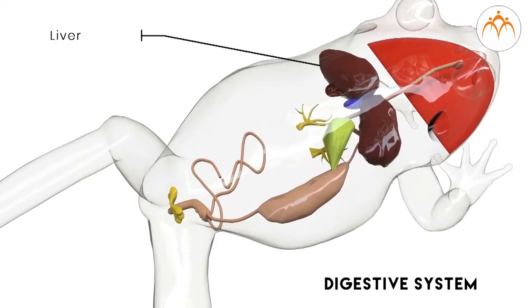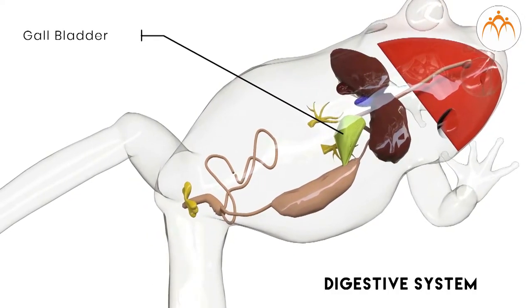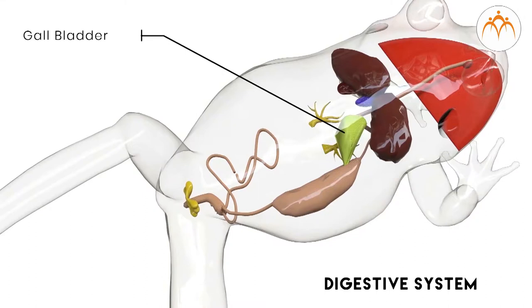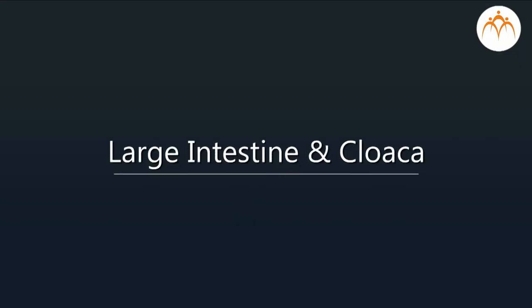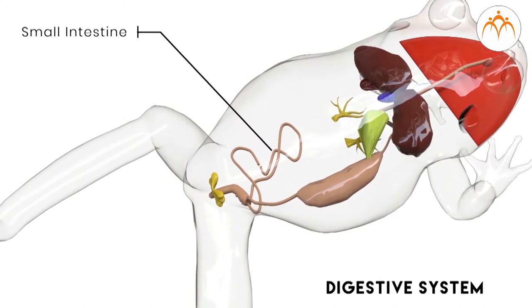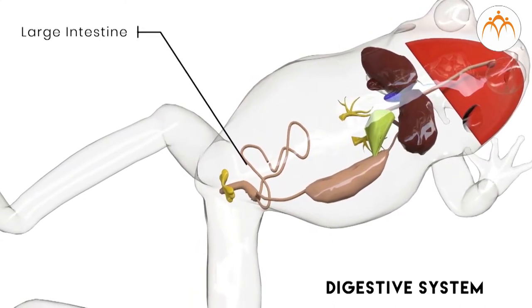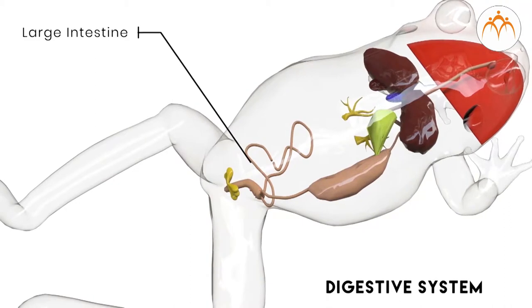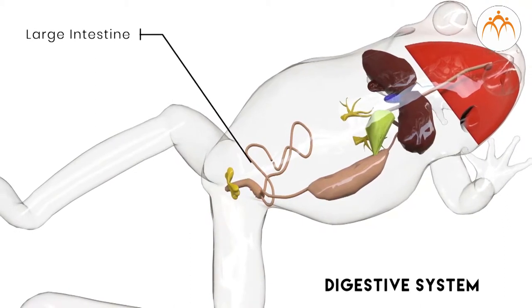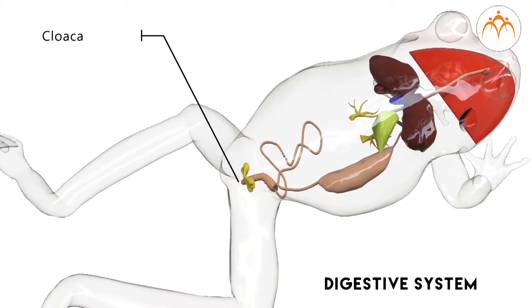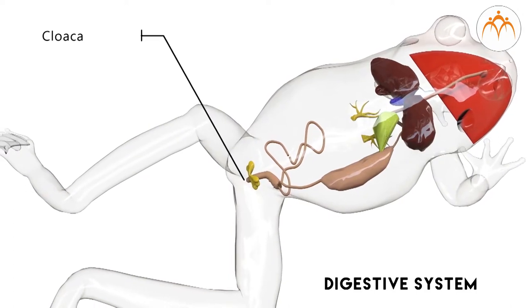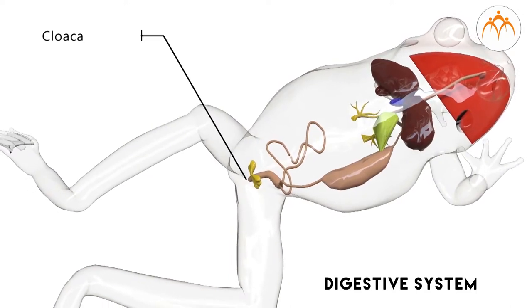Now students, have a look at the glands one by one. Liver, pancreas, and gall bladder. These three glands are connected with the small intestine, and their enzymes play an important role in digestion. Large intestine and cloaca. Small intestine opens into large intestine. Undigested food is stored in the large intestine and then it moves to the cloaca. Cloaca is an opening to throw out undigested food out of the body.